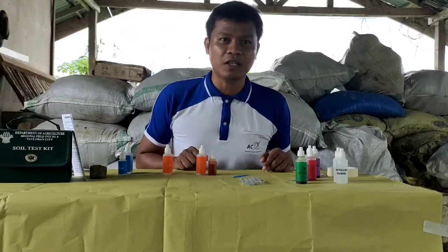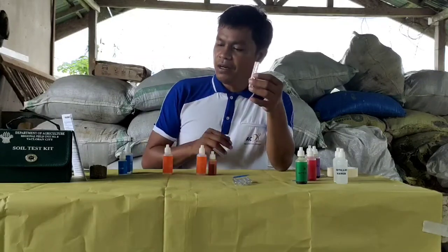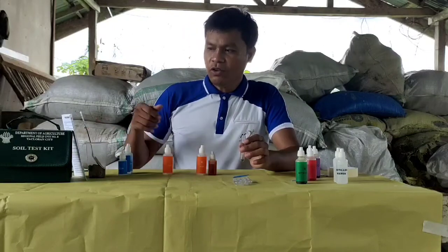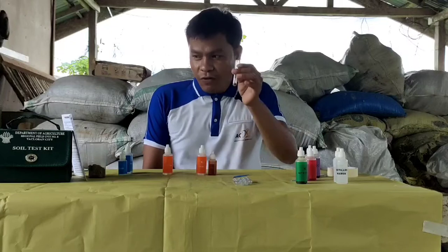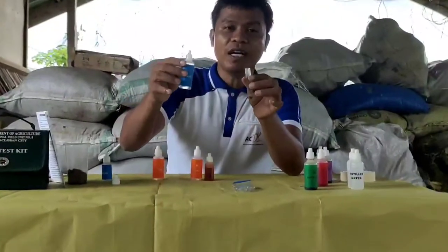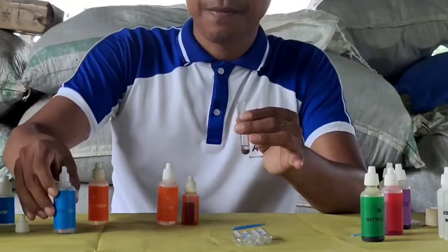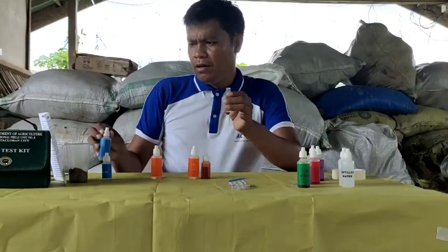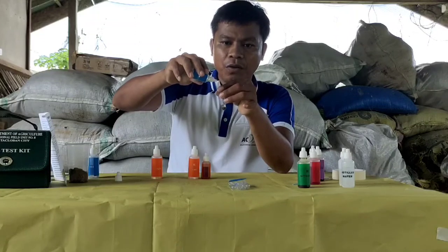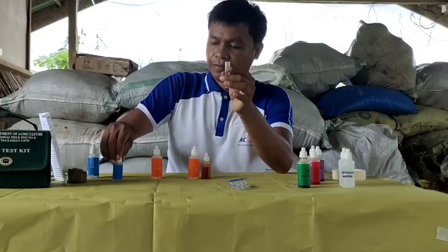Nandito na tayo sa pangatlo nating soil test — ito po yung soil phosphorus test. We have the test tube here. We put some soil here. We put 24 drops of solution P into this test tube. And then 4 drops of solution P2. We mix it by gently swirling the tube for about 1 minute.